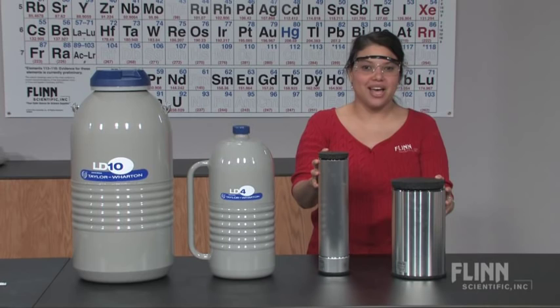Performing demonstrations with liquid nitrogen in your lab is a lot of fun and contains excellent educational value for your students. How do you safely transfer, store, and dispense liquid nitrogen? You use Dewar flasks from Flinn Scientific.